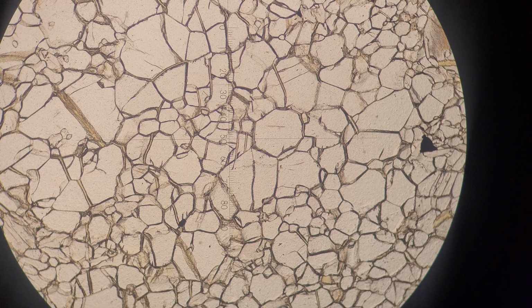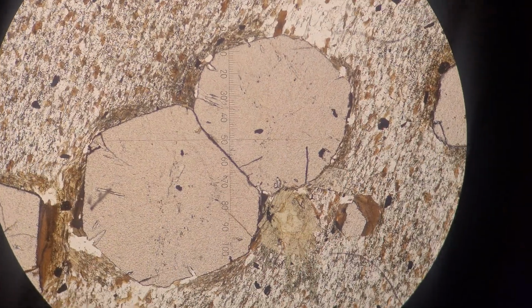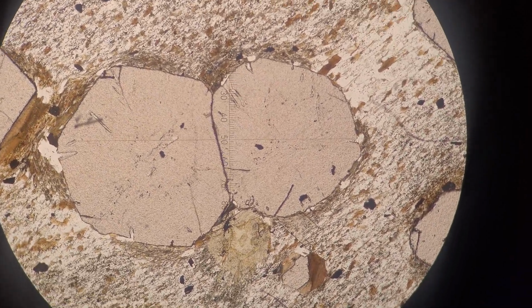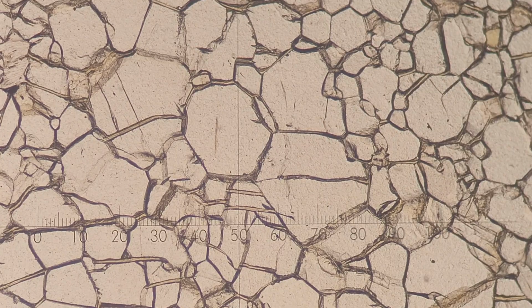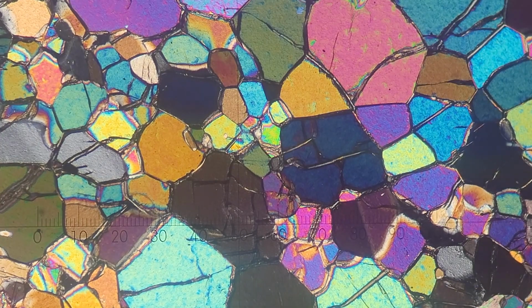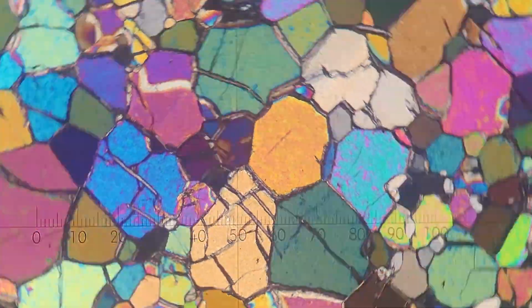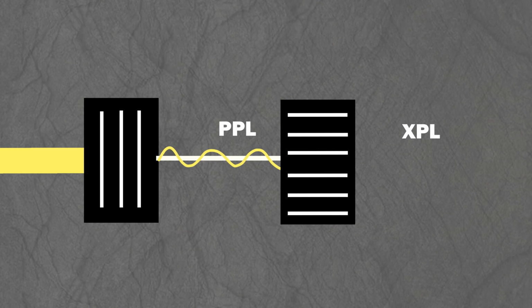It's also important to note, not all anisotropic minerals exhibit pleochroism, but no isotropic minerals do. So if you observe pleochroism in a crystal, you can be sure it's not an isotropic mineral like garnet. But if you don't observe pleochroism, you can't rule out anisotropic minerals. Plane polarized light can help identify a mineral, but more techniques are required to assist in the identification. So next we'll look at the optical properties of minerals under cross-polarized light.